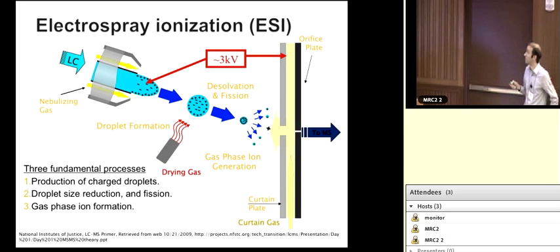What is mass spectrometry? Well, the process of mass spectrometry involves taking neutral metabolites or molecules, or whatever it is you're looking at, and turning them into ions. So why do we need to make an ion? Well, mass spec is a technique that works entirely on ionized molecules, and the reason is because it uses the useful property of ions that charged particles can be moved and manipulated in a magnetic or an electric field. If you have a neutral metabolite or a neutral molecule floating around, it's not going to be influenced by any sort of external field you apply to it.